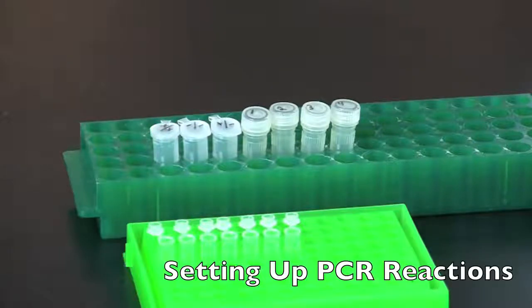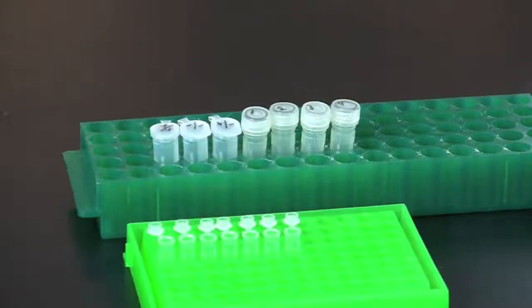If working in groups, each person in the group should prepare one PCR reaction using the following procedure. Each lab group should have a rack with the following samples: a plus plus control, a minus minus control, a plus minus control, and tubes with student samples. Each group should also have a set of PCR tubes labeled to match the DNA template samples.